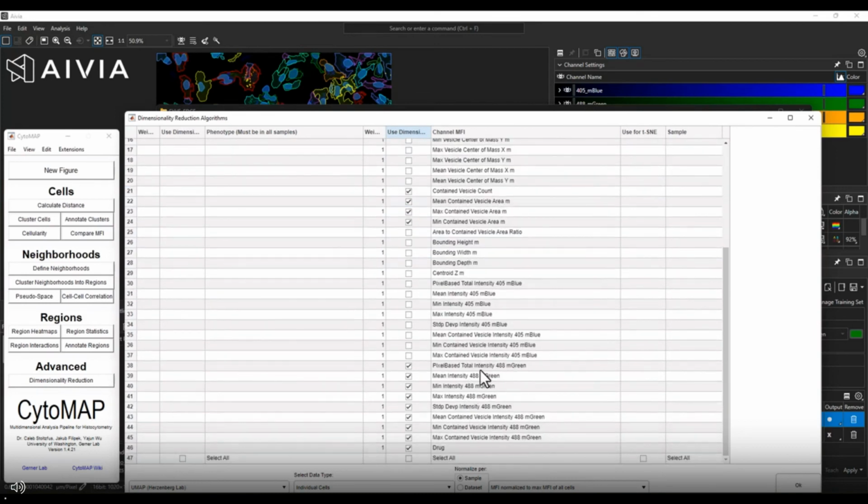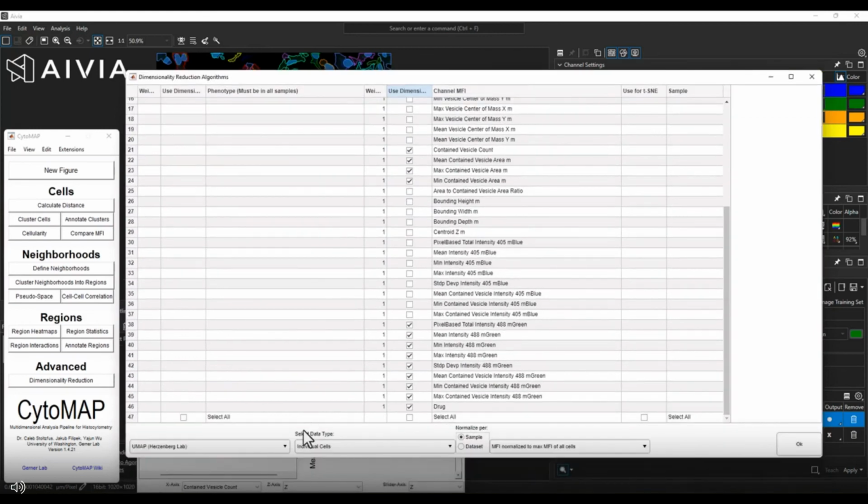that we can explore. In this example, I've chosen UMAP, the nonlinear dimensionality reduction technique that I discussed earlier, but you could choose from other techniques such as principal component analysis or t-SNE. After selecting from the options, you can see how this tool can help to reduce many parameters down to 2 for visualization and data interpretation.